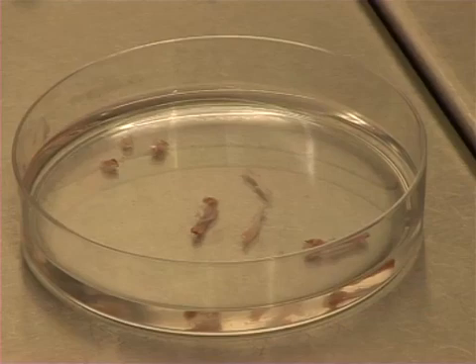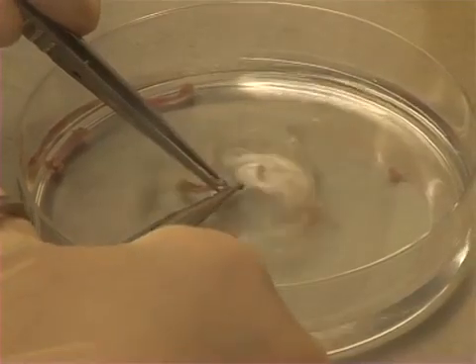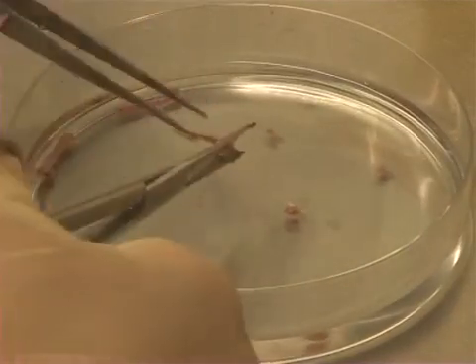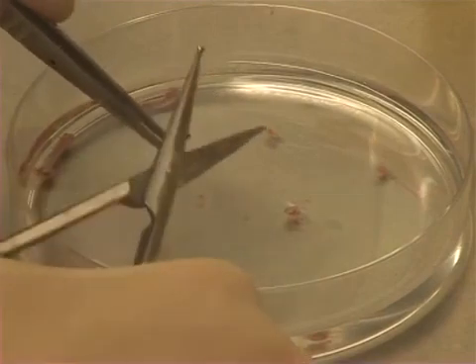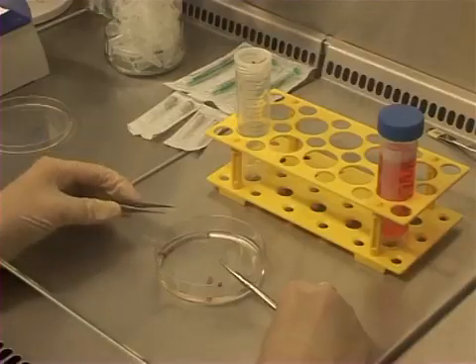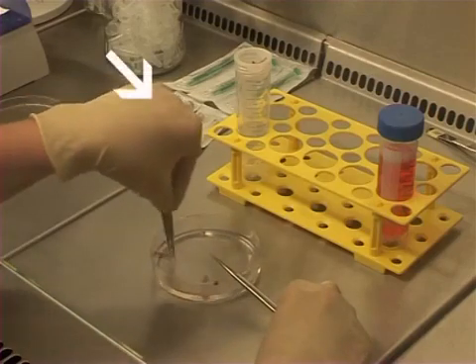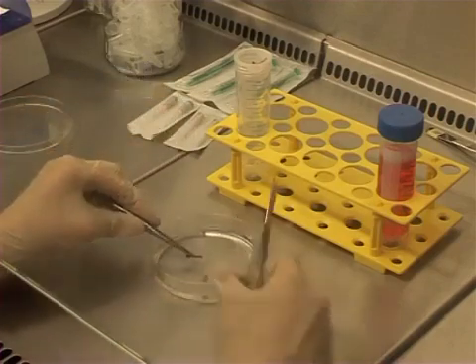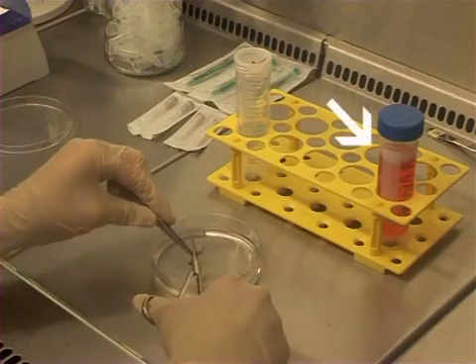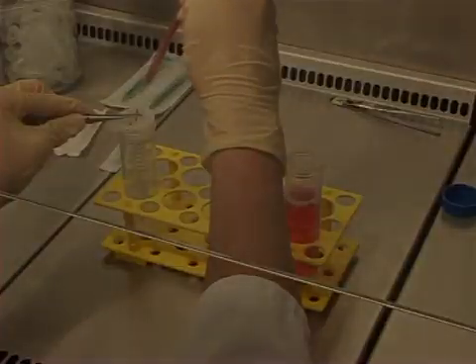Muscles and sinew will be removed from the bone. Femur and tibia are rinsed with warm PBS several times. For harvesting the bone marrow, the proximal and distal ends of each bone are cut with a pair of fine scissors. In order to rinse the bones, we need one sterile 28G needle, one 1 milliliter syringe, and between 10 to 15 milliliters of medium per bone.